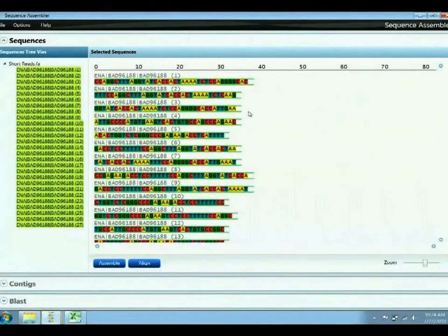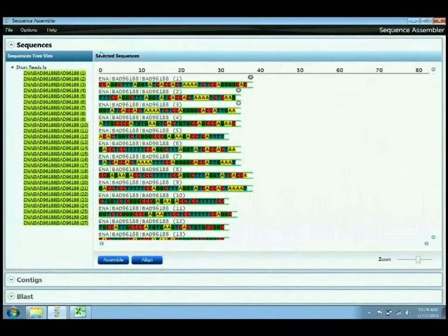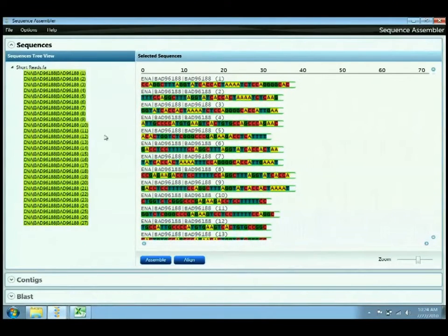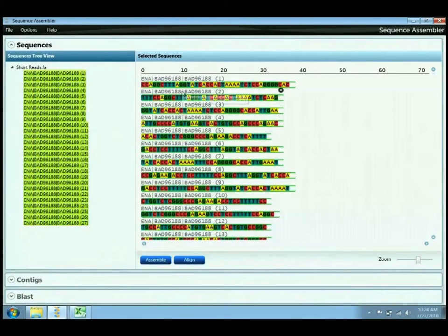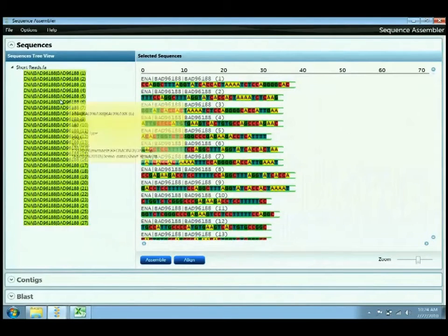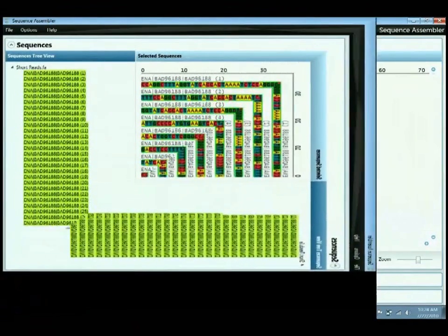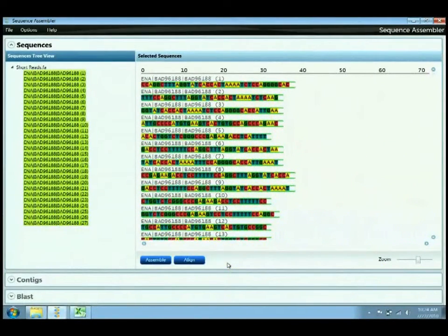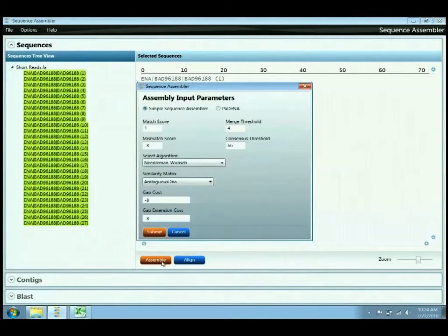The first demo I'd like to show is the capability of the Sequence Assembler to monitor and assemble the short read format of DNA sequences. Here you can see I just opened a FASTA format file with a number of short reads, where the sequence information is described in the right hand pane. The left hand pane shows the various sequences in that file. The next step in a typical flow of DNA alignment or assembly would be to align or assemble the short reads.